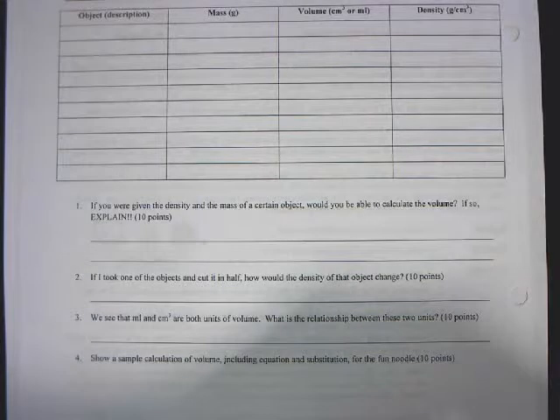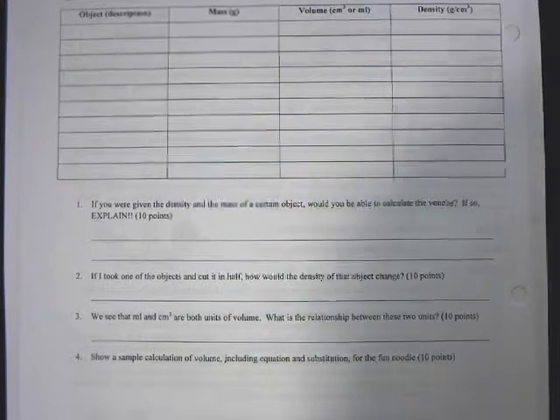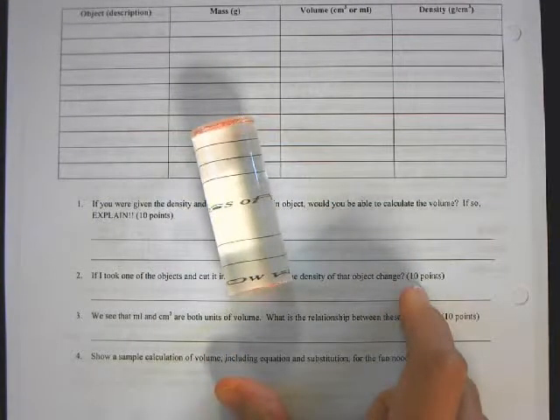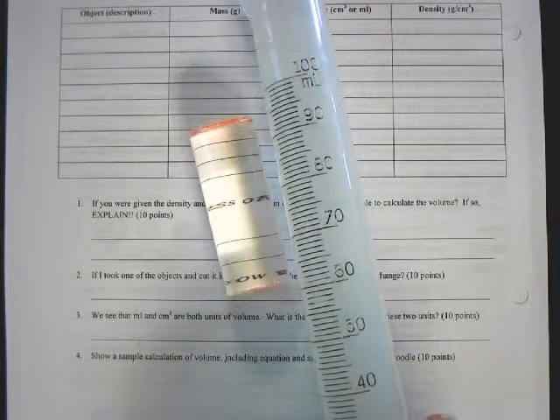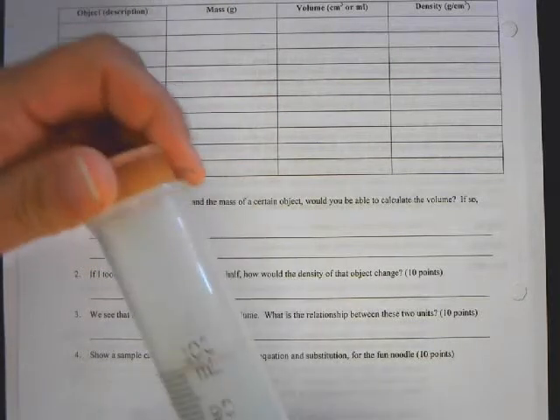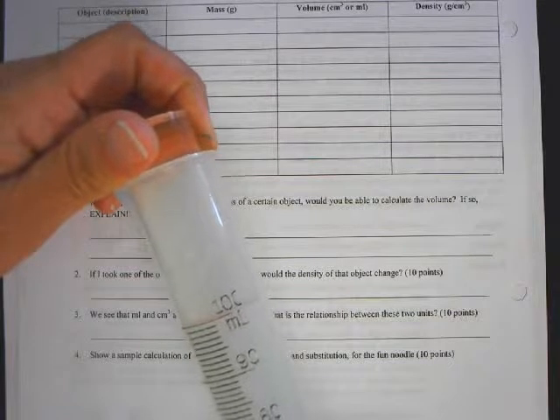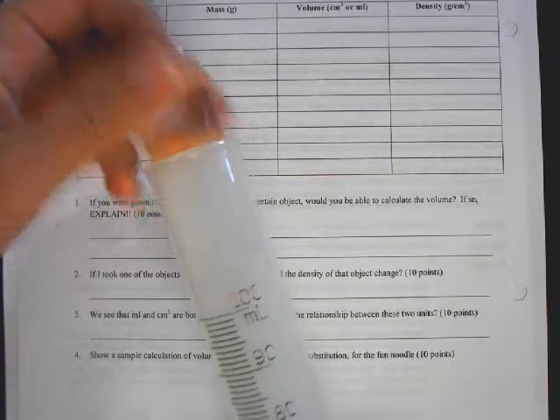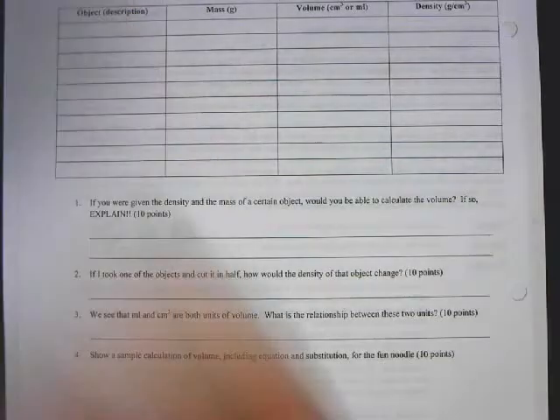What we are not going to do is put this in here, because when we do, it just barely fits. When the water's in there, we're not going to be able to get it out. And please don't test me to see if these properties of water actually exist, because it'll be very difficult to get this out. So do not put this in there.